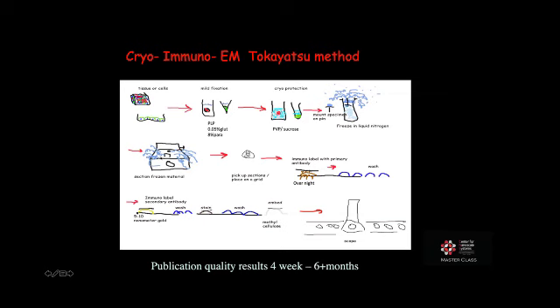We mount this specimen into a frozen microtome, cut sections, pick up the sections with a drop of sucrose, place them on a grid, and then we can carry through with our immunolabeling. Now, cryo-immuno-EM is not cryo-electron microscopy. The cryo part refers to the sectioning stage of this preparation technique. Once we pick up the section, it's thawed. It's at room temperature, but it is hydrated, which is where we get the advantage to be able to immunolabel.